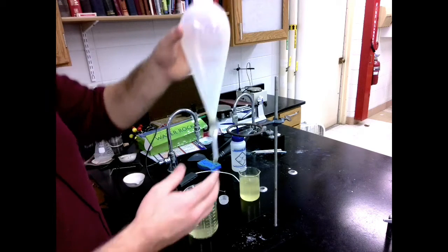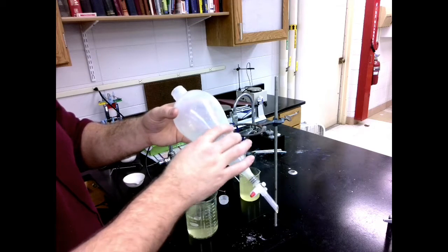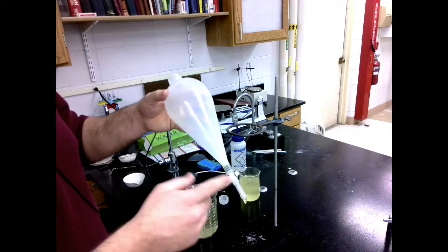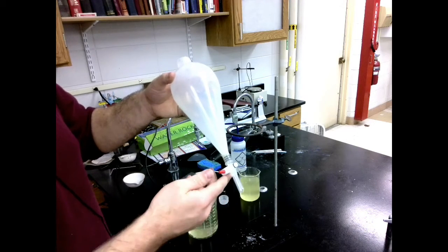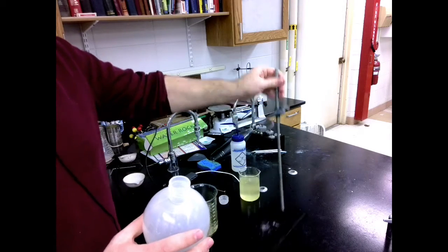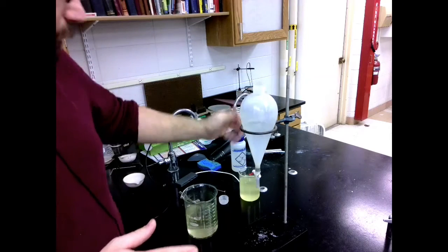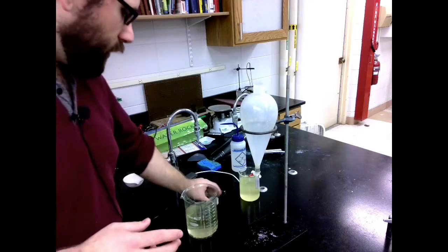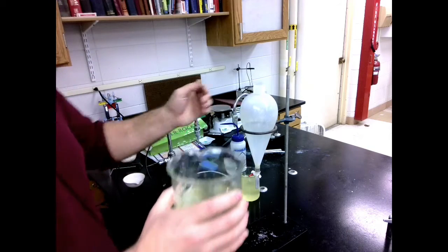A separatory funnel has this thinner nozzle on bottom, and then it expands out. And it has a stopcock on the end that allows water, or other fluid, to drain cleanly through. And so what we're going to be doing is just setting up a ring stand with a ring here. Nothing fancy, just something to hold my separatory funnel. They'll come with these tops on them. And I just need to pour my entire mixture into this separatory funnel.